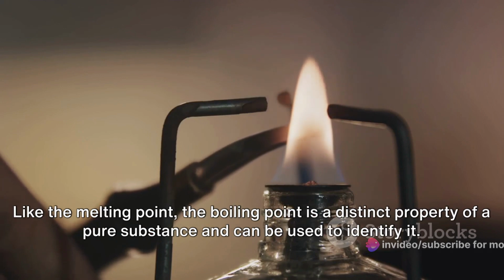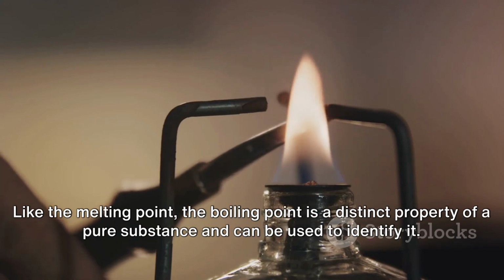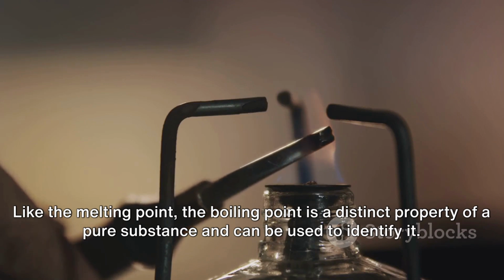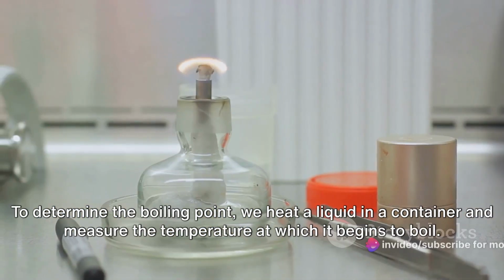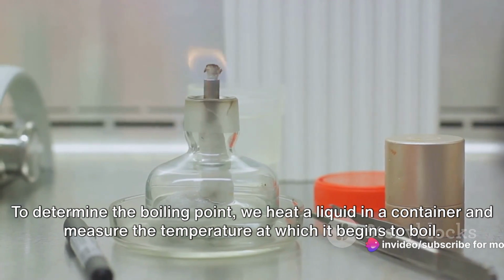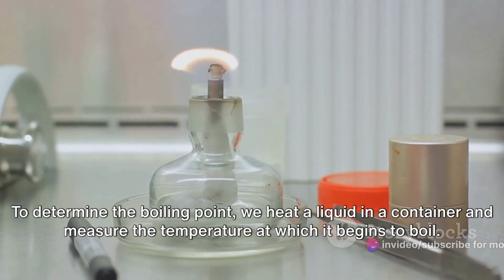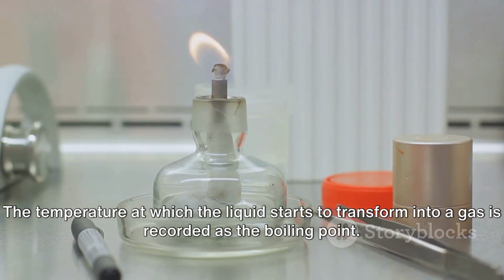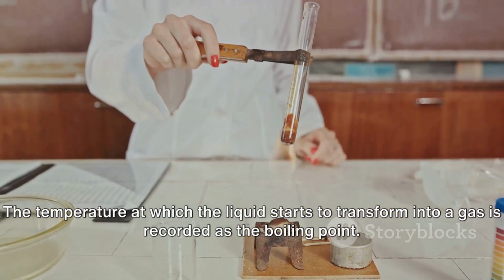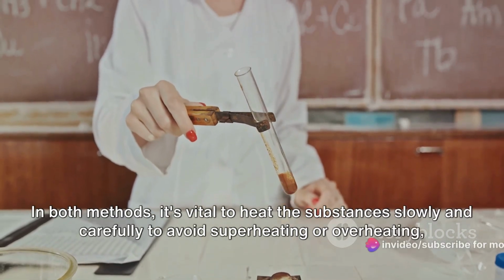On the other hand, the boiling point is the temperature at which a substance transits from a liquid to a gaseous state. Like the melting point, the boiling point is a distinct property of a pure substance and can be used to identify it. To determine the boiling point, we heat a liquid in a container and measure the temperature at which it begins to boil. The temperature at which the liquid starts to transform into a gas is recorded as the boiling point.